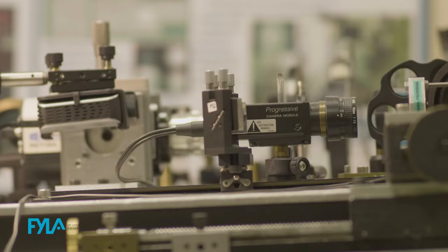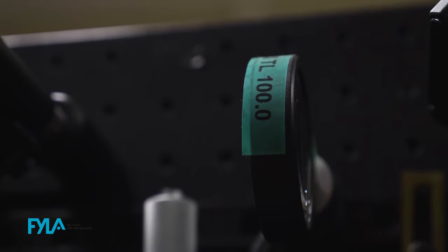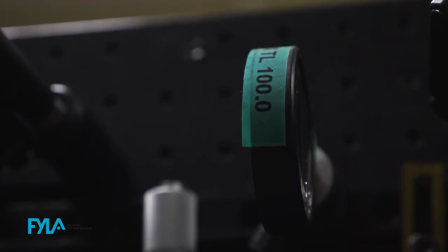Dr. James Germann has a long international track record in non-linear imaging of organic specimens, including collagen. He explains the unique attributes of SHG microscopy and the key elements to consider when building an SHG microscope.